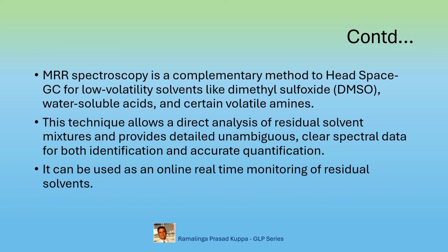It can be used as an online real-time monitoring of the residual solvents. Its online compatibility allows for real-time monitoring, supporting pharmaceutical manufacturing processes like process analytical technology PAT and quality by design QbD concepts.